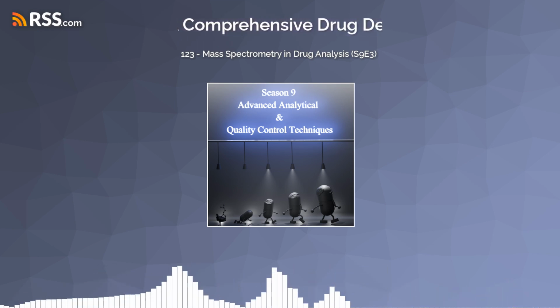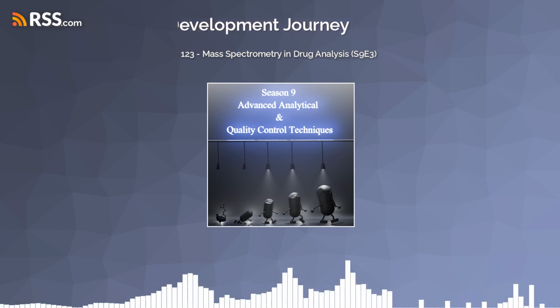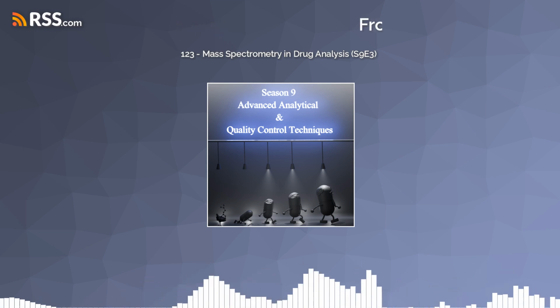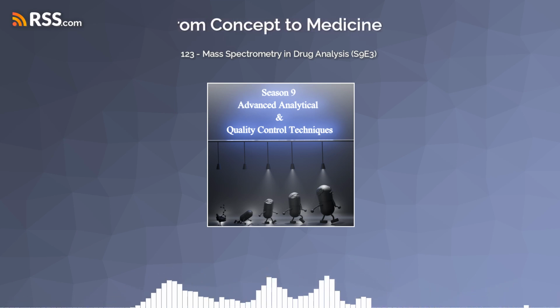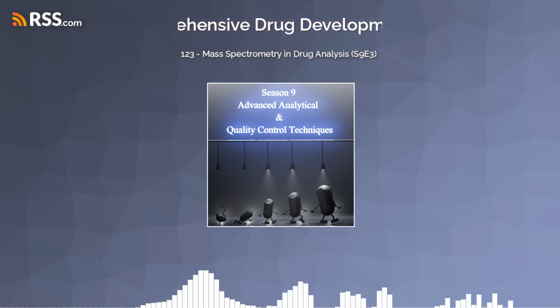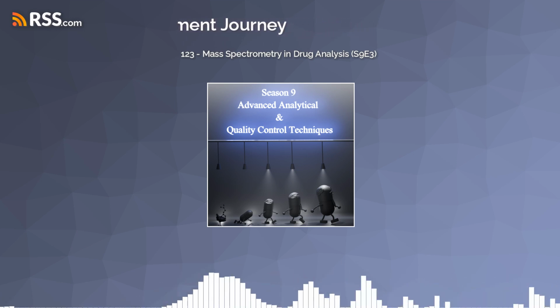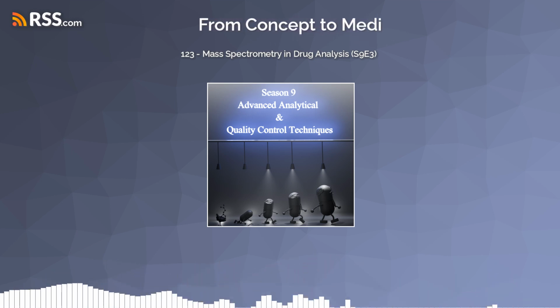And let's say they spot a new peak appearing on their chromatograms. This new peak means a degradation product is forming. Basically, the drug is breaking down into something new. Now, mass spectrometry comes in to identify exactly what that new compound is, like getting its molecular fingerprint. And knowing that helps them figure out if it's harmful. Yes. If it is, they can take steps to prevent that breakdown from happening, maybe adjust the formulation, add a stabilizer, or change the packaging, all to ensure the drug stays safe and effective for as long as it should. So it's like preventive medicine for the medicine itself.